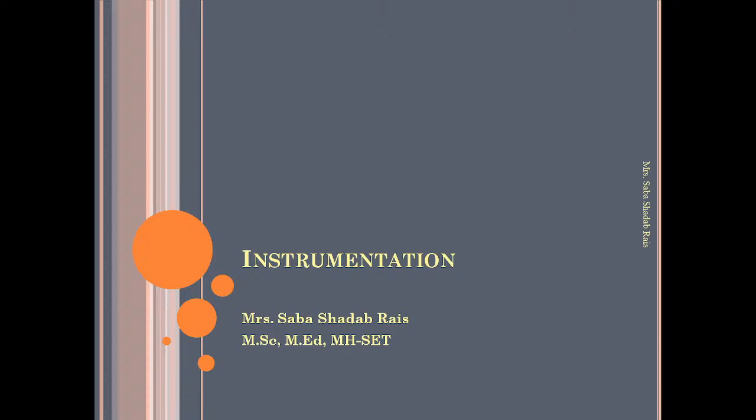Let me explain why instruments are so important. Instruments help us find out various types of concentration. When I talk about the microscope, instruments definitely help me see biological samples in a broader view.